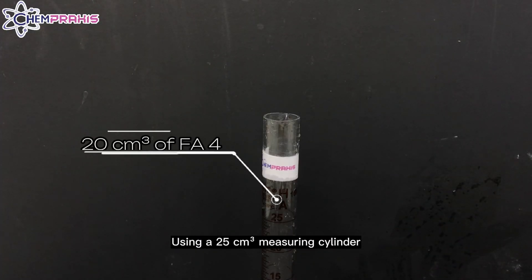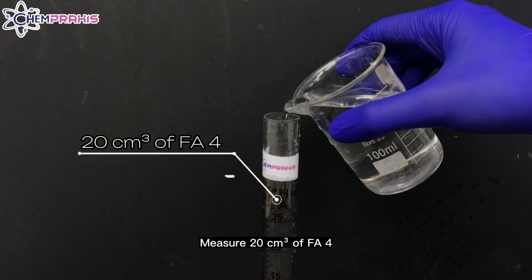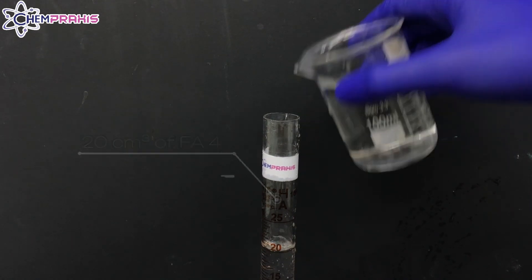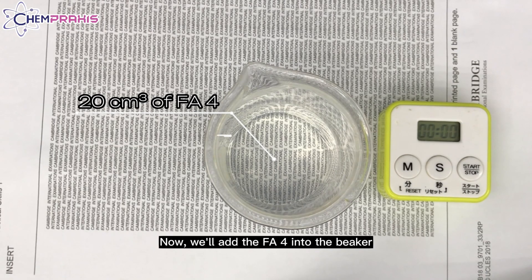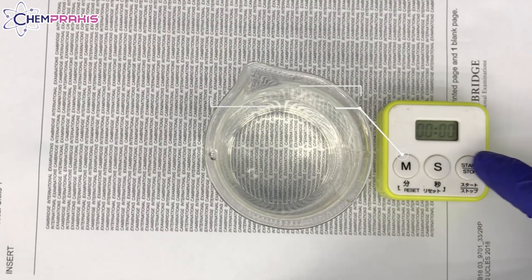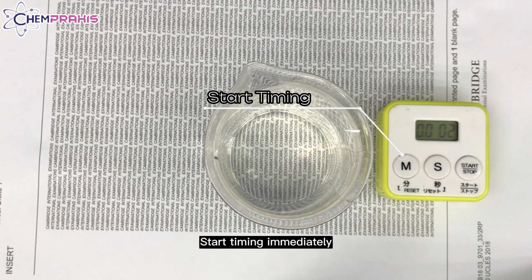Using a 25 cm³ measuring cylinder, measure 20 cm³ of FA4. Now we'll add the FA4 into the beaker. Start timing immediately.